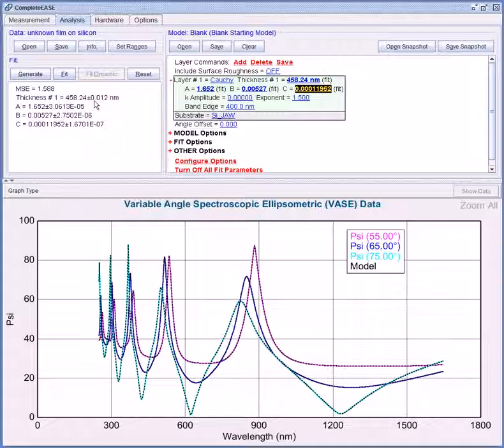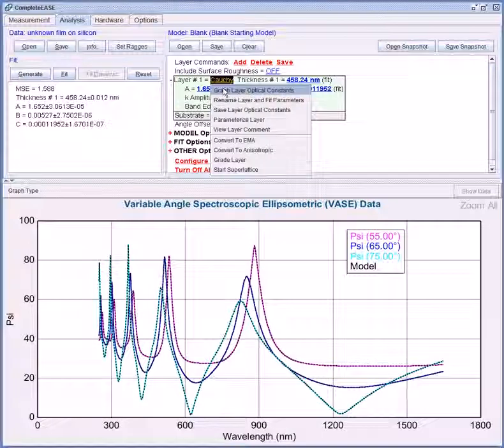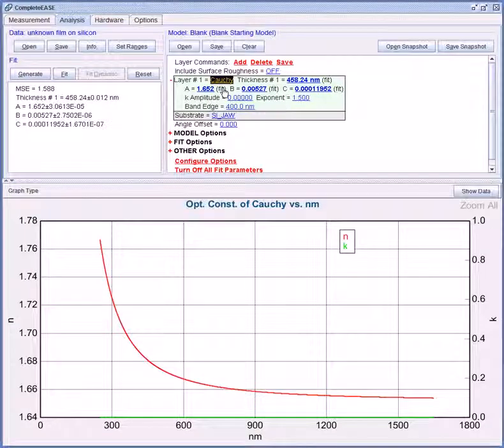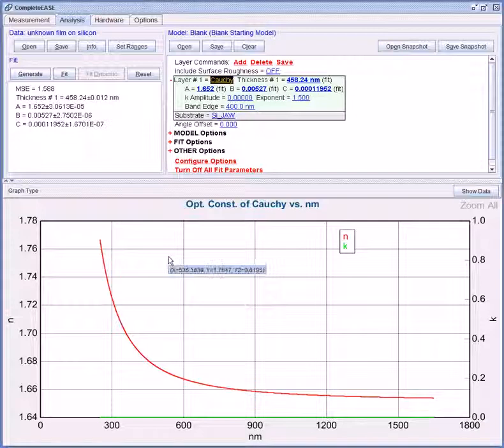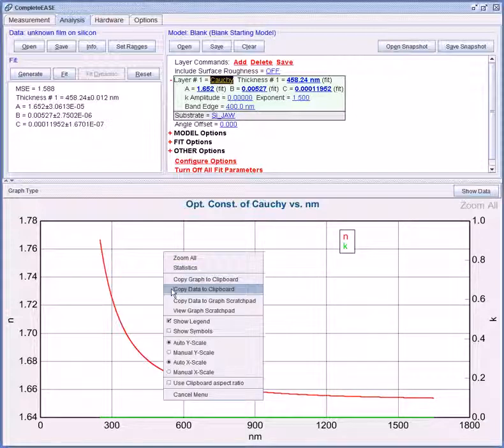So I have the thickness reported here. If I want to view the resulting optical constants I can right click on the Cauchy layer. Select graph layer optical constants. Now these are displayed in the graph panel. I can right click, copy graph or copy data to clipboard, paste in Excel or any other program.